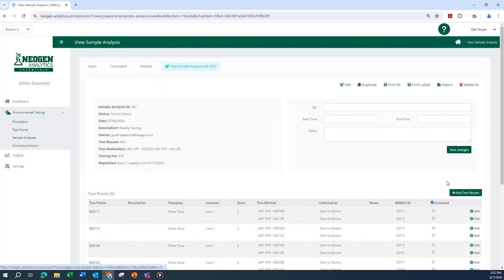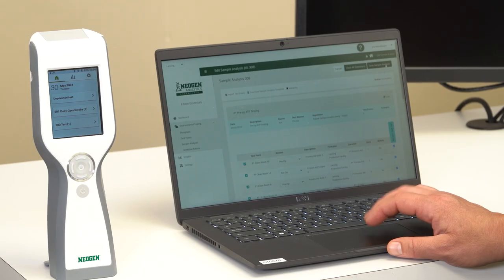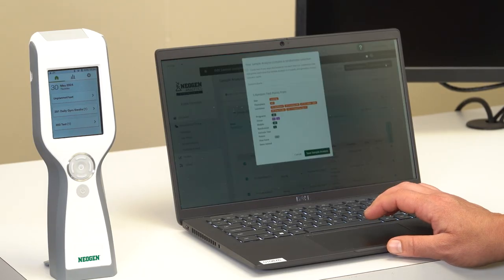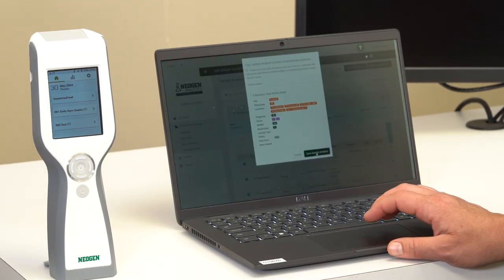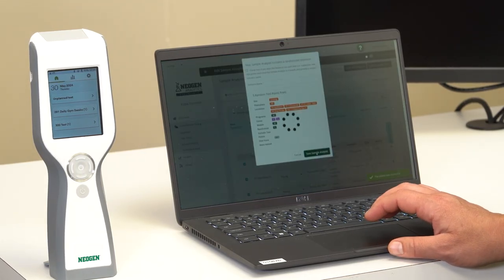Once locations are added, select save sample analysis. The sample plan can be adjusted based on results as the program progresses.